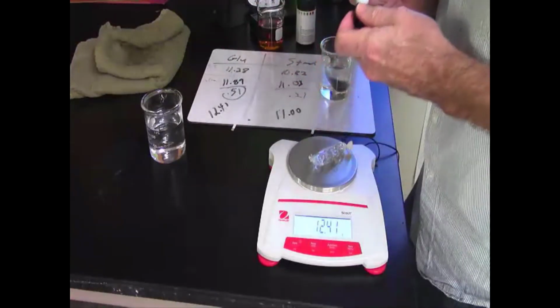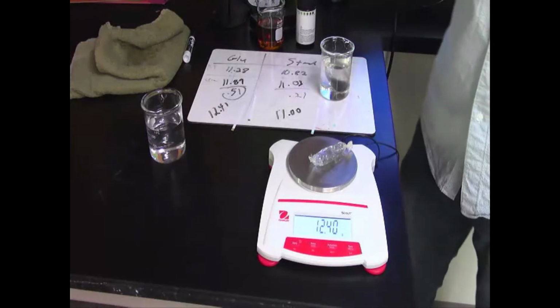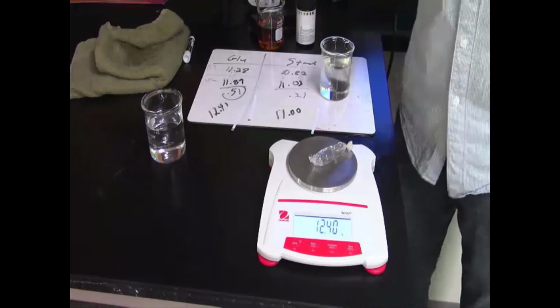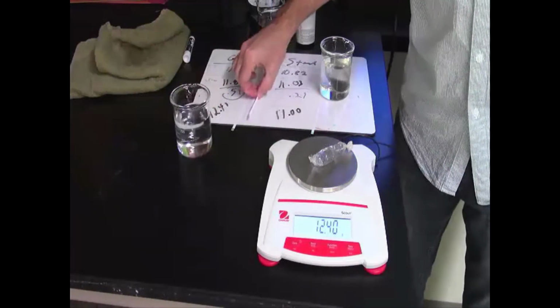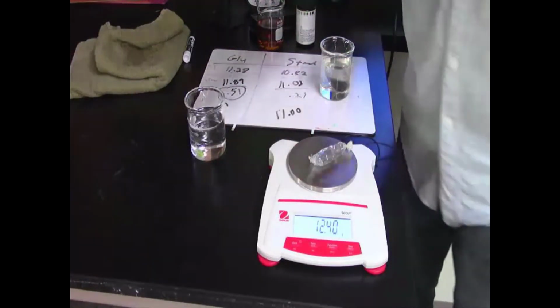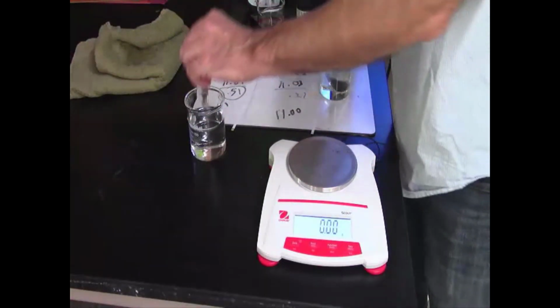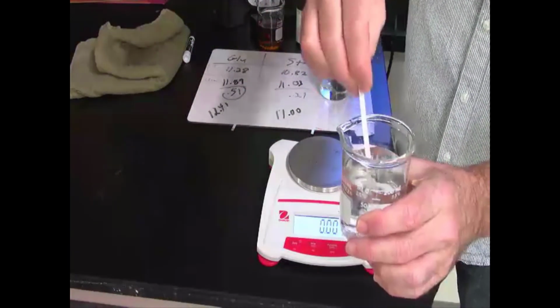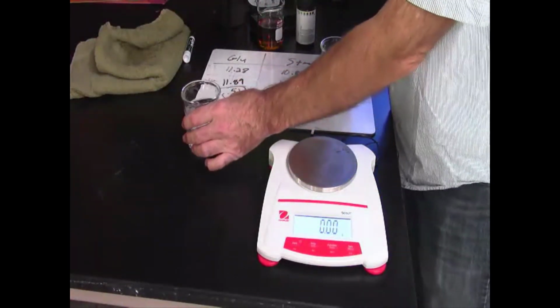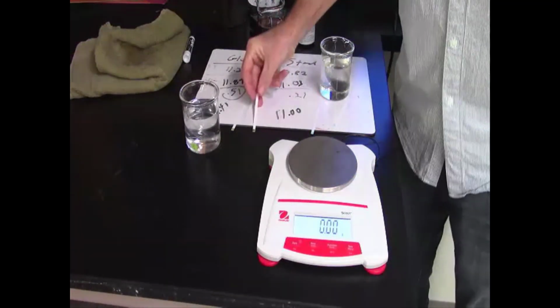12.41 grams. So it went up by quite a bit. It went up by over a gram. So that's approaching 10% heavier than it was yesterday when we began. One other thing about this is, if you look at the glucose strip, that's positive again. And what that means is that glucose is leaking out of the bag, out of the fake cell, into the solution right here. So that's a definite positive step for that.